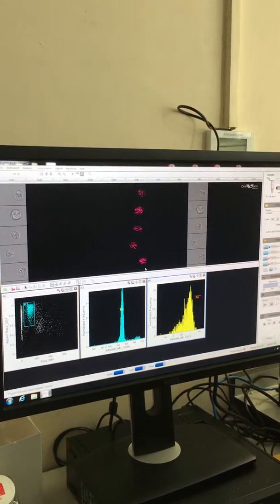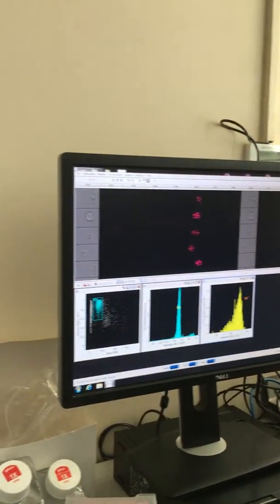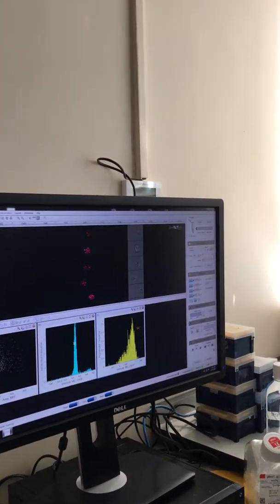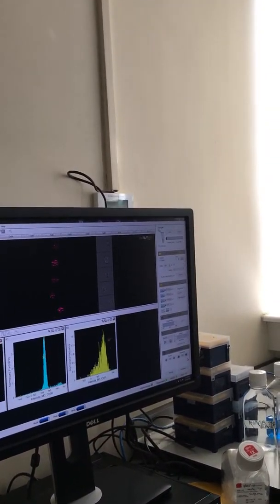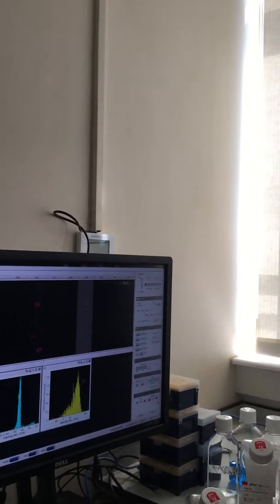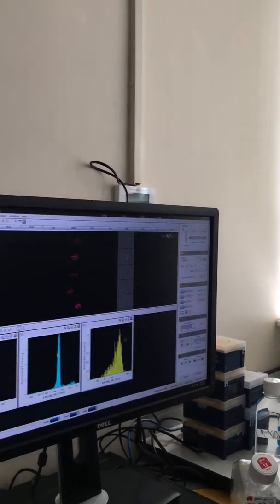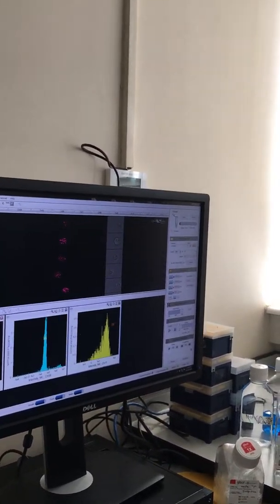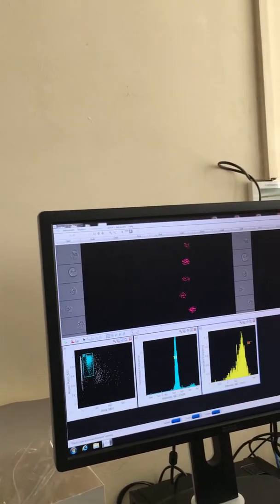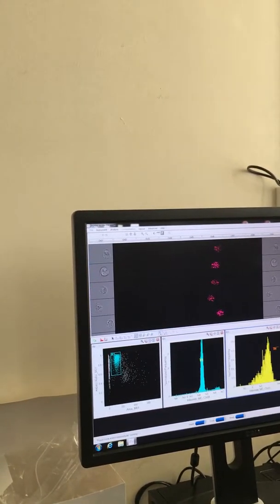Because they are the same population, so mostly it's gonna be the same as the isotype. The centering is not dependent on the cell type. Imagine the flow comes down in a column. If it's off, you need to change it and center it. So you're just changing the beam. It's not about the population. It's just about how the flow, the stream, is angled. Or at least that's my understanding.